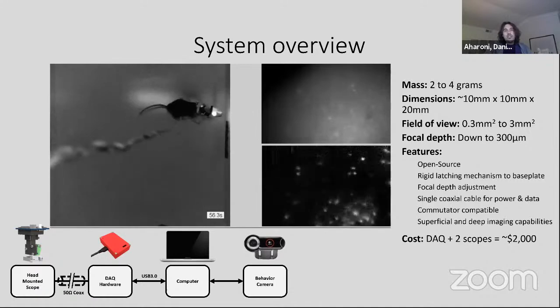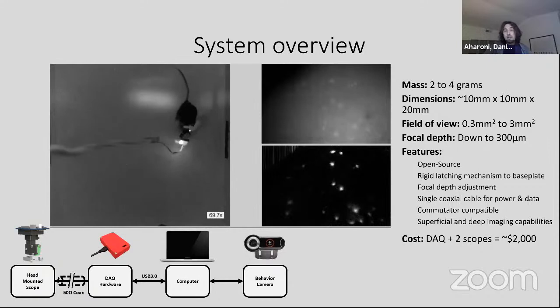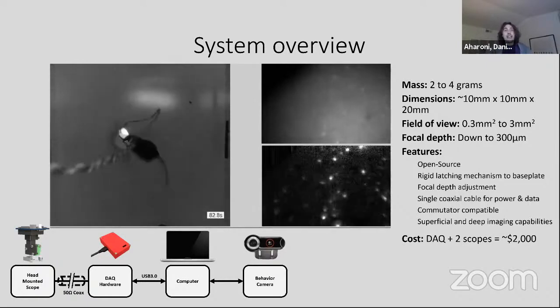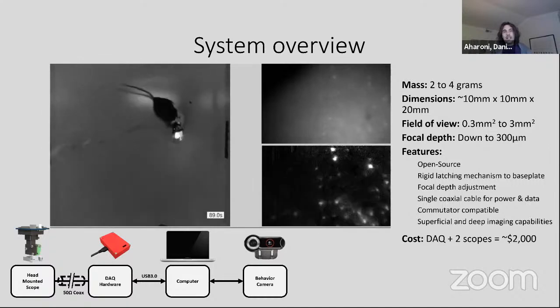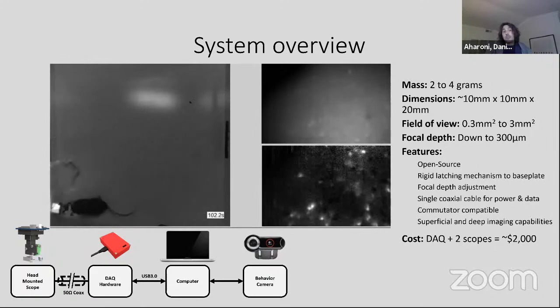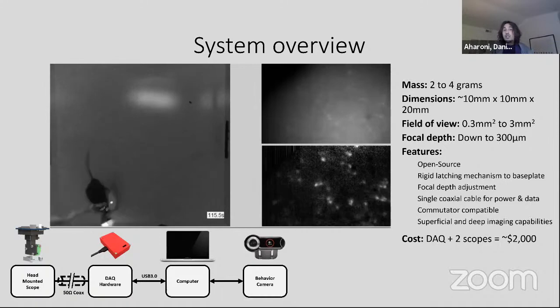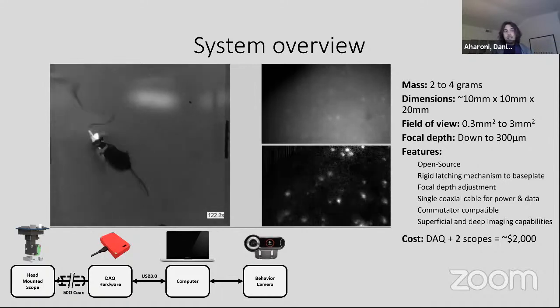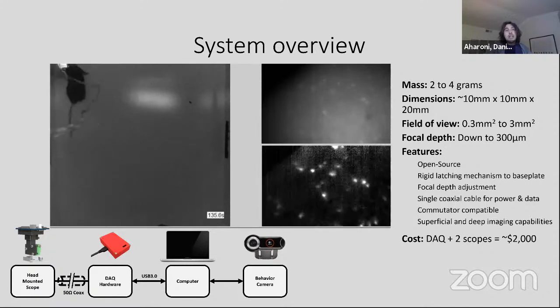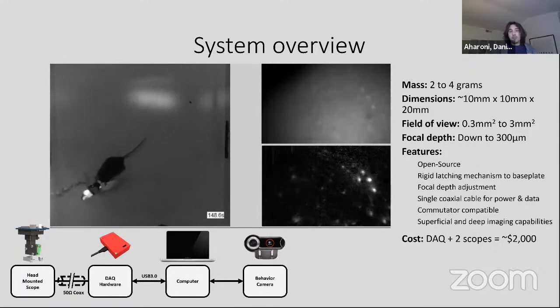We know, for most of their experiments, researchers are going to invest a ton of time in training their animals, doing surgeries to plant an optical probe or something. And you don't want to get all the way to that point and then have tools that are faulty or fail in the middle, which can happen, will happen with all tools, but should happen not often. And since our tools are open source and most people build the microscope themselves, if the mouse chews through the cable, you don't have to be worried about fixing it yourself.